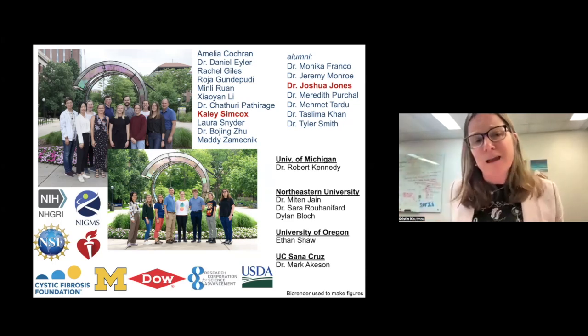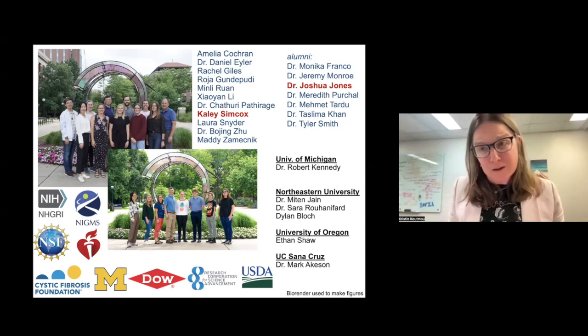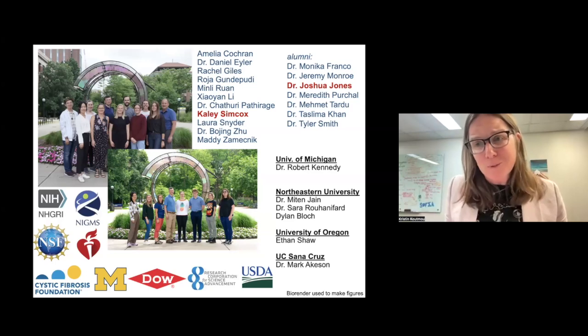And I really just want to emphasize, I think this is something that we as a community really need to think about. If we want people to be able to do these sorts of measurements, we need to make it possible for people to use these techniques where they're at and not just have to own an Orbitrap in their own lab in order to be able to do it.